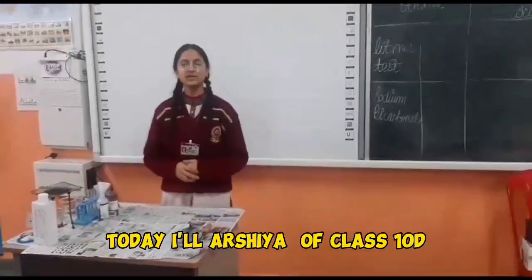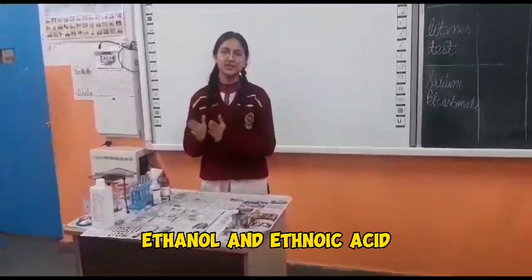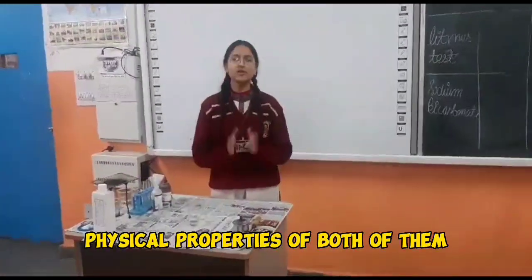Hello everyone, today I, Arsha of class 10D, am going to perform a few tests to distinguish between ethanol and ethanoic acid. So first of all, we should know about some basic physical properties of both of them.